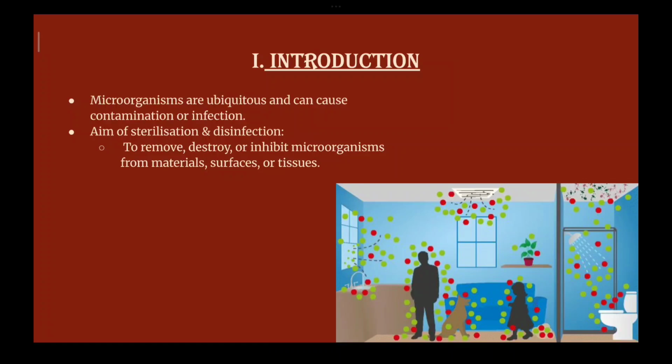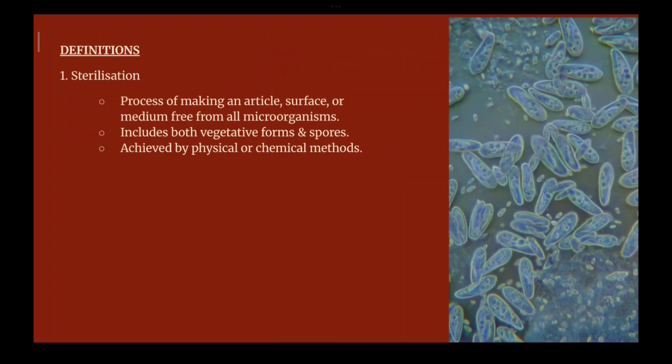So what is the aim of sterilization or disinfection? It is to either remove the microorganisms completely, or to destroy them completely, or to inhibit their action against the tissues or surfaces that the microorganism is residing on. The definitions of a few such terms are given here.